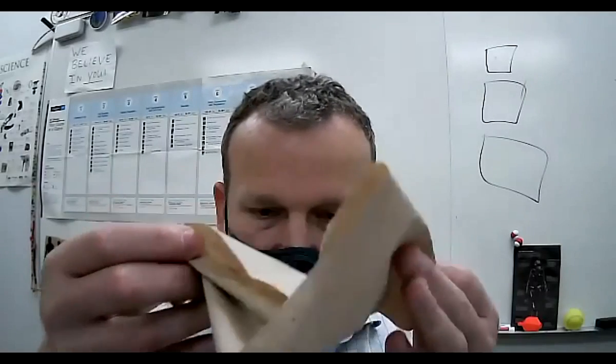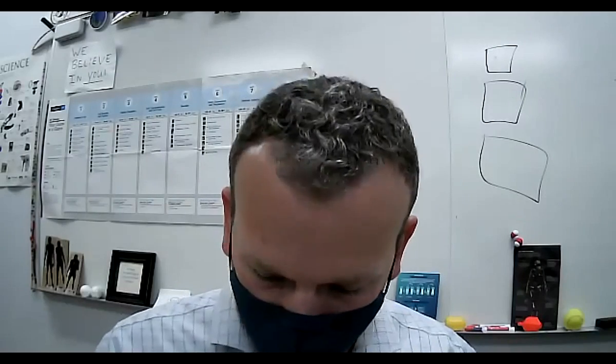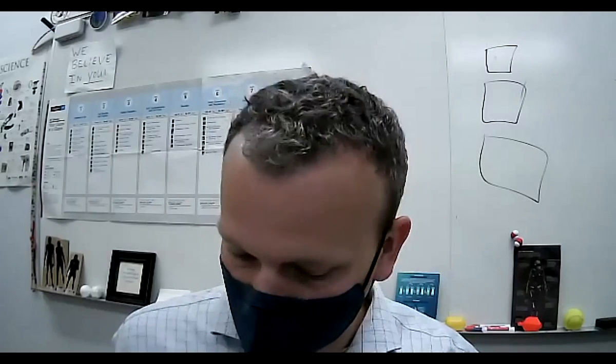First, I would do this. Why would I put them into the paper towel like this and kind of blot really quickly after coming out of the solution? Because there I guess would be some external solution that could increase the mass artificially, right? So I blot it to remove that confounding factor. And then I put them on the scale to weigh them for a final mass. So at that point, you could calculate the percent mass change.